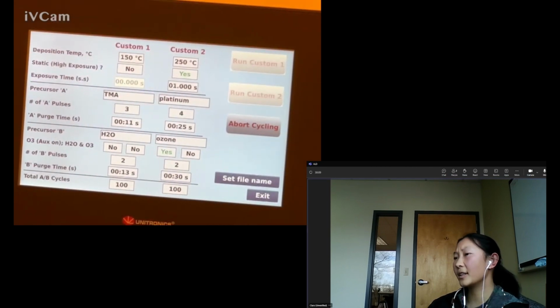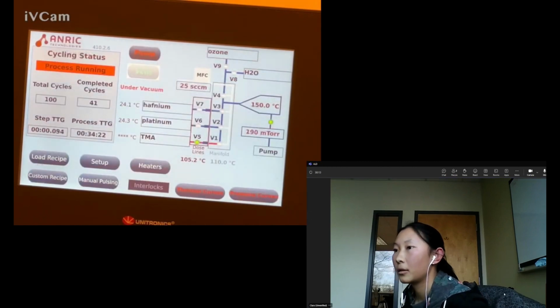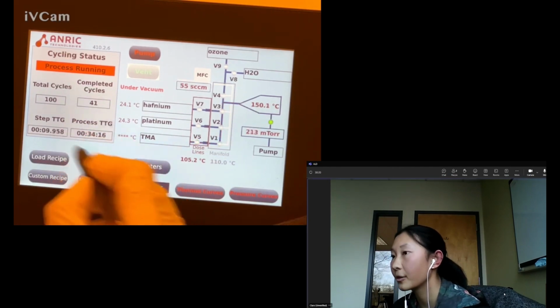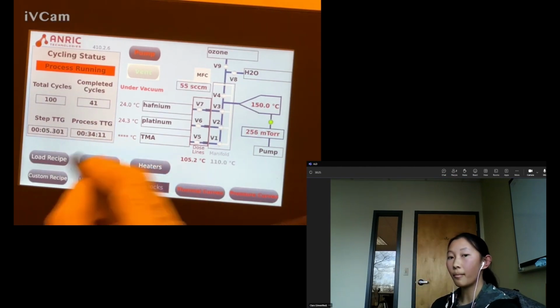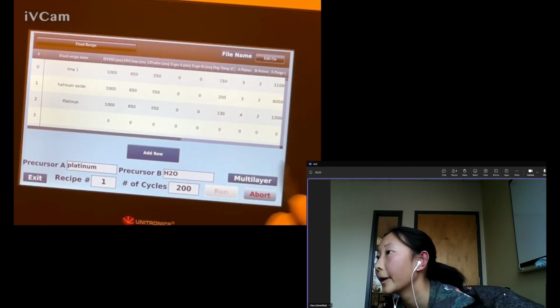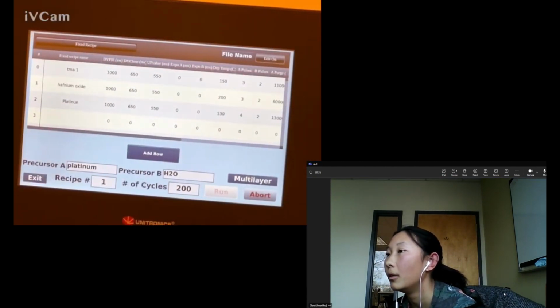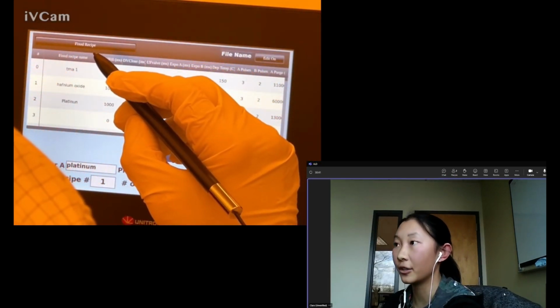Now can we save this in the load recipe? I don't know if a platinum recipe is already in the saved. Okay, load recipe. The load time will still be 34 minutes left. Yep, and there's already a platinum recipe in there. So we got DV fill, DV close. This is slightly different than what we had in the custom recipe, right? No, the custom recipe uses these same values.